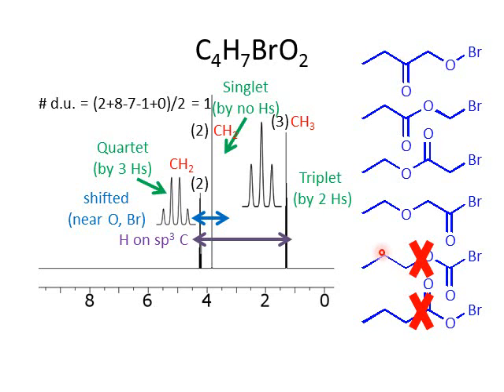So at least in theory, you could see a 12-peak pattern because you would see a triplet of quartets or a quartet of triplets. In practice, those would tend to be more messy looking because they overlap. In either case, we see a clean quartet, a clean singlet, and a clean triplet. Can't be these.